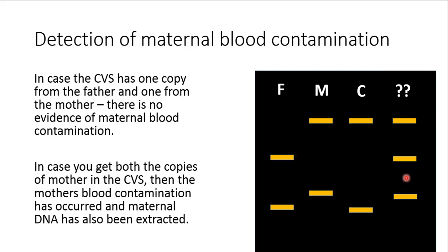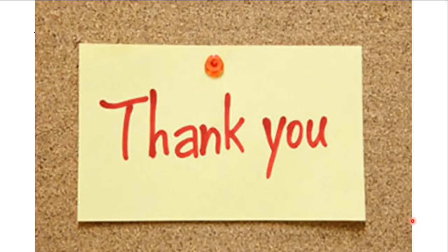However, if we get a pattern where one band corresponds to the father and one to the mother — so far so good — but an additional band is also present which corresponds to the mother, then what you're actually finding is both copies of the maternal VNTR pattern in the chorionic villi sample. This can occur only when maternal blood has contaminated the DNA being extracted from the chorionic villi. This point is very important and has profound implications for antenatal thalassemia diagnosis. Thank you for listening, and more about antenatal thalassemia diagnosis will be covered in the next lecture.